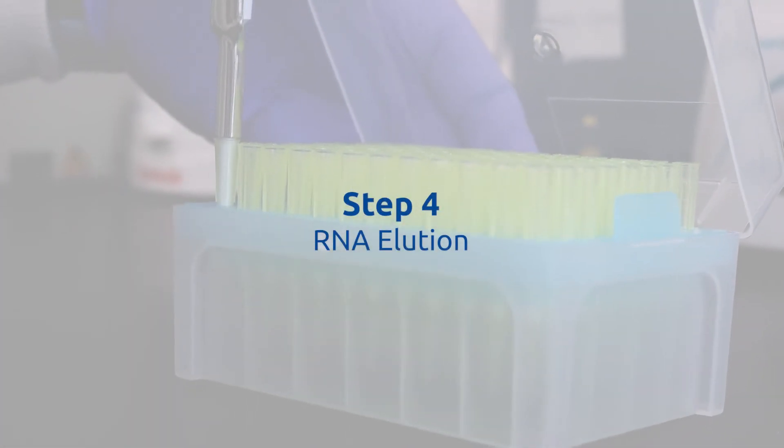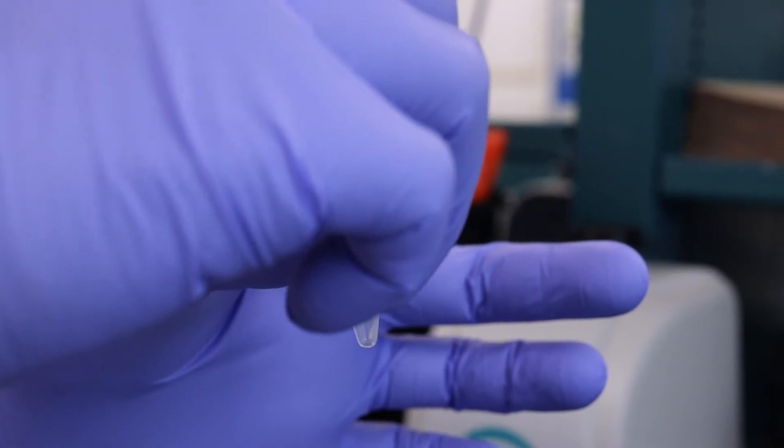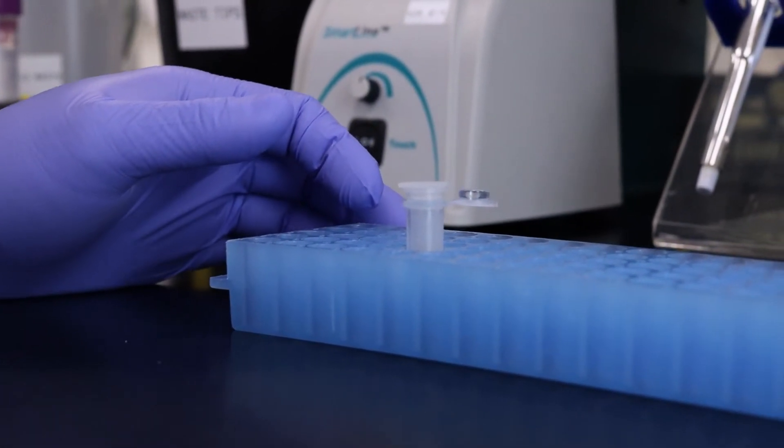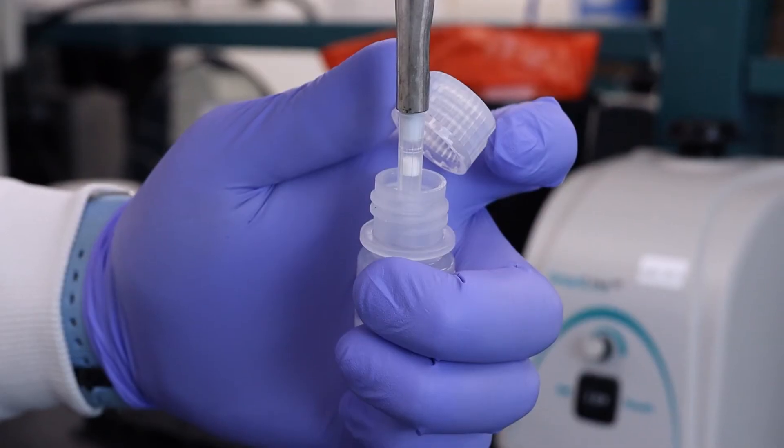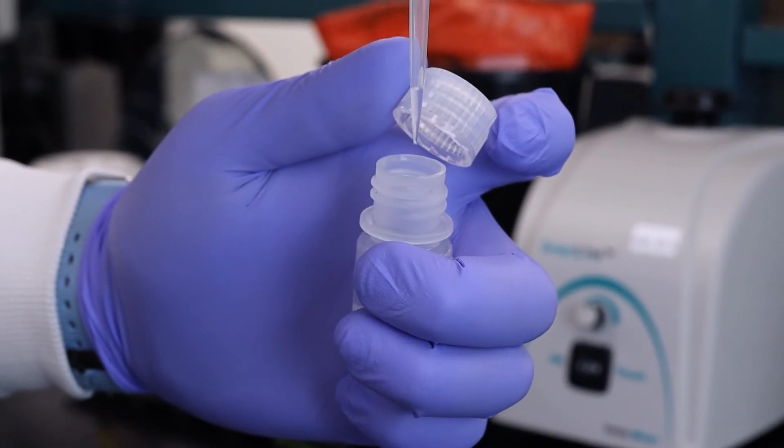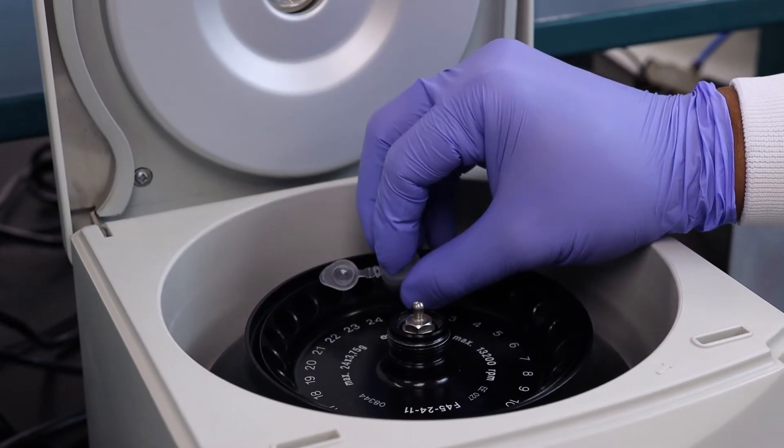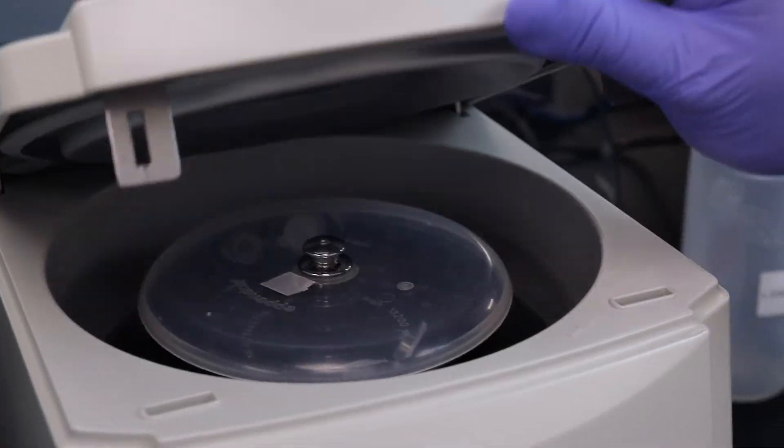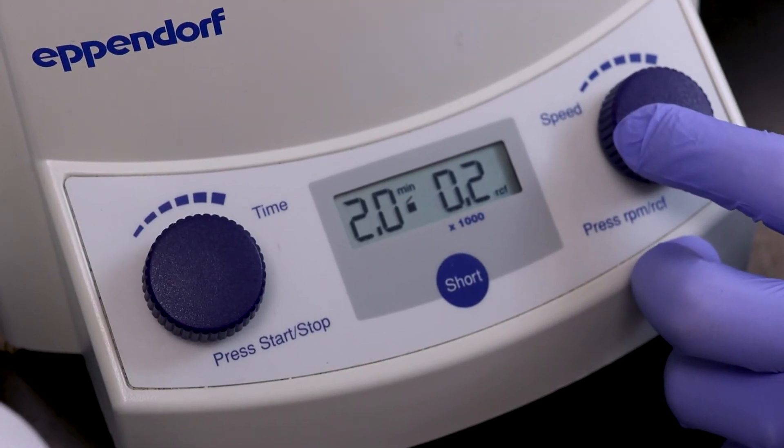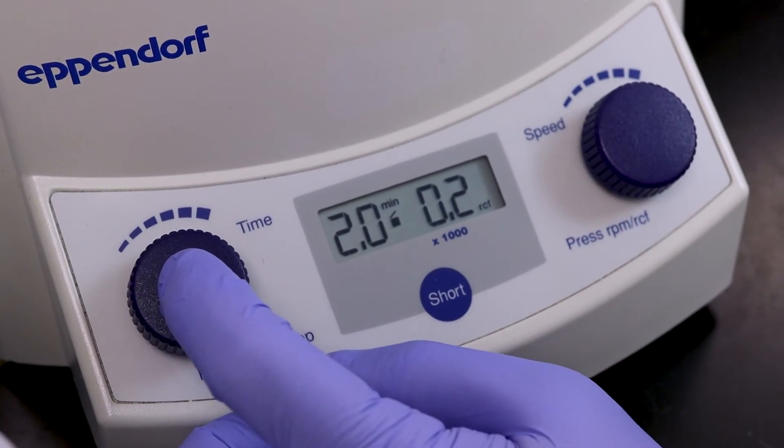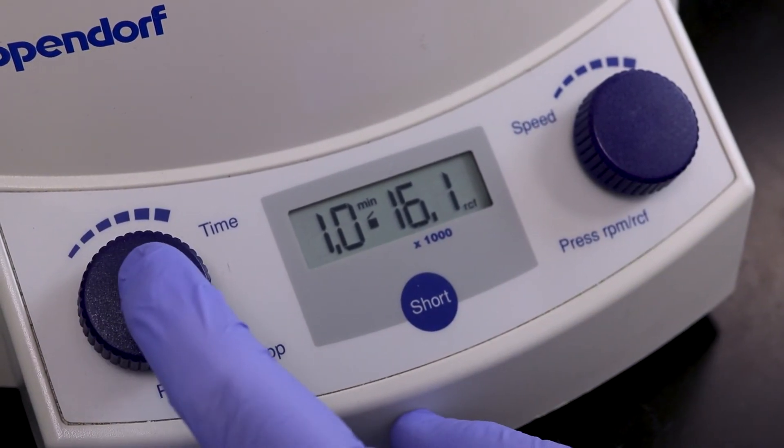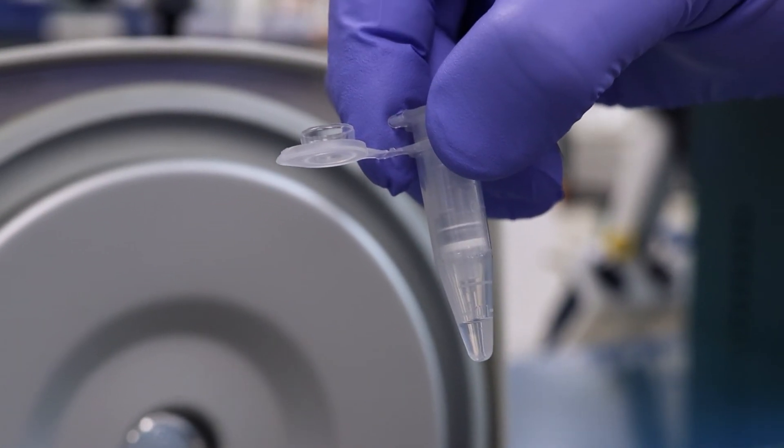Step 4. RNA Elution. Place the column into a fresh 1.7 milliliter elution tube provided with the kit. Add 50 microliters of elution buffer E to the column. Centrifuge for 2 minutes at 200g or 2000rpm, followed by 1 minute at 14000g or 14000rpm.